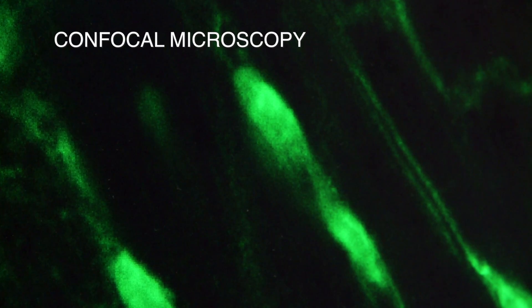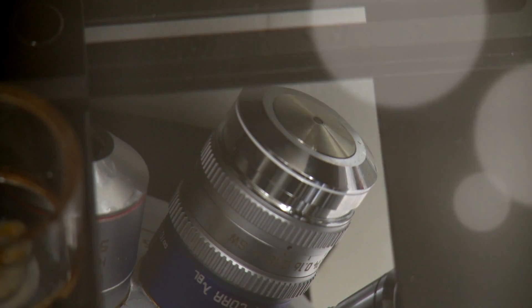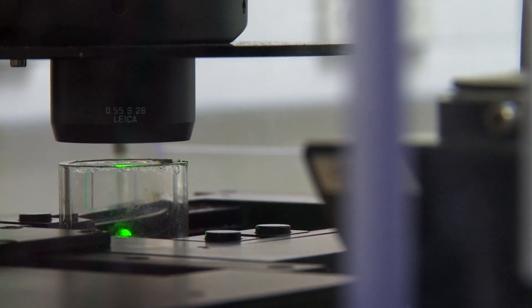Whereas a conventional light microscope, when you look down it, there's a lot of excess fluorescence that gets in the way. The way that Confocal works is it removes this excess fluorescence and you get a really nice clear image.